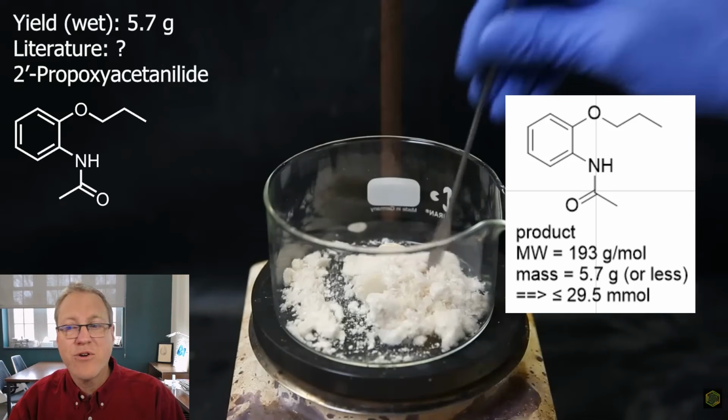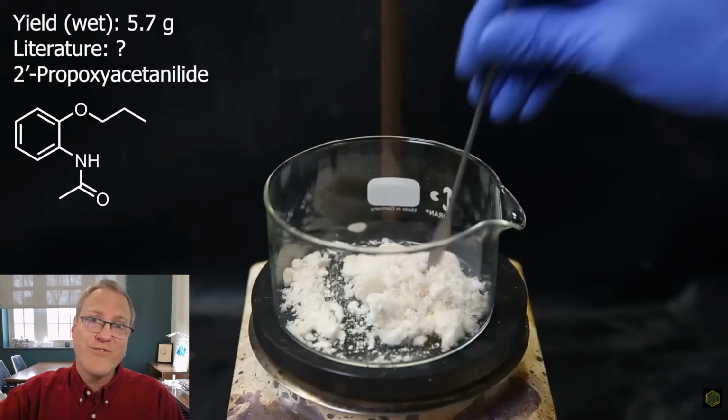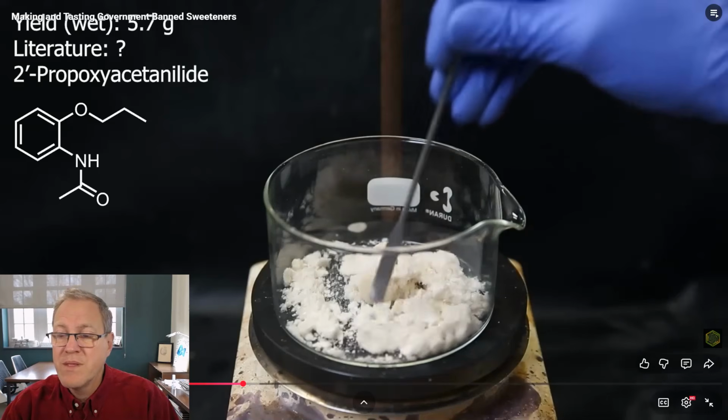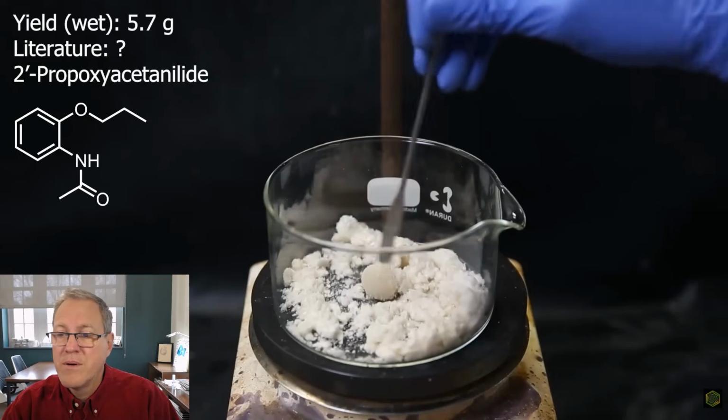Now he's lost some material. But where do you lose the material? Well, he just did a recrystallization. Anytime you do a recrystallization, you're going to lose material. The benefit is your material is cleaner. The downside is you're going to lose some material. It's just the cost of doing business. The slightly wet yield turned out to be 5.7 grams. But again, I will not dry it, since it is not necessary.